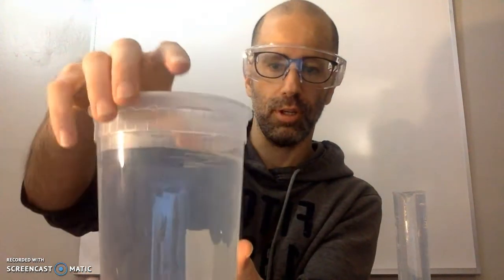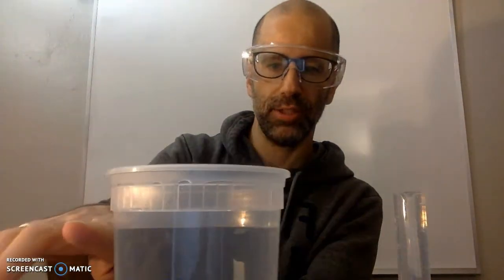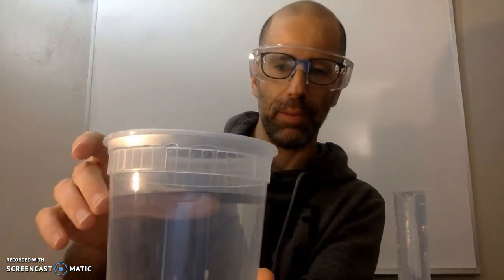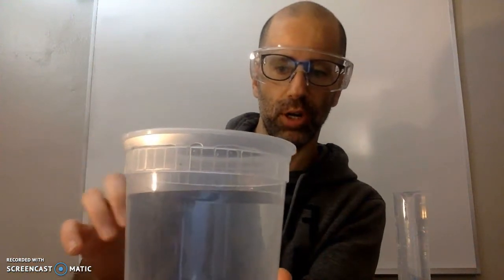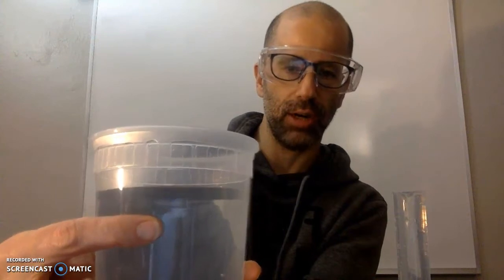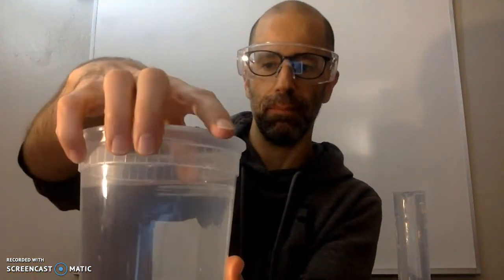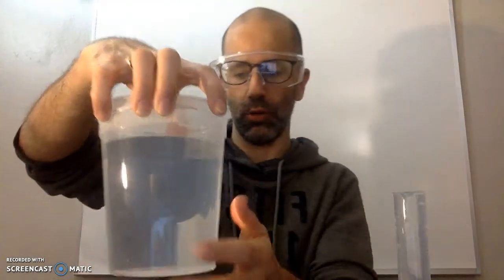This container is filled up to about here — that might be a little too much. You might want to go down less, maybe about down to here, for the purposes of the lab, since it might overflow. You don't want it to overflow.